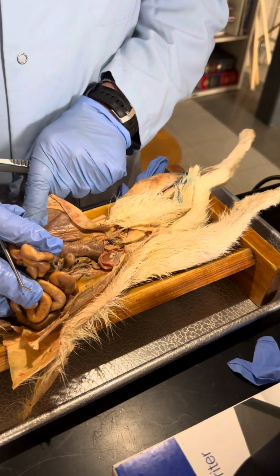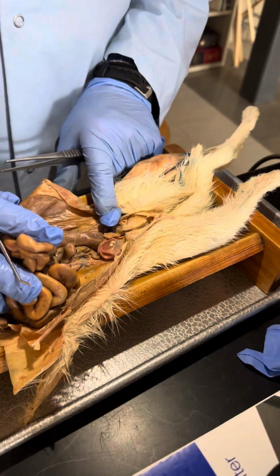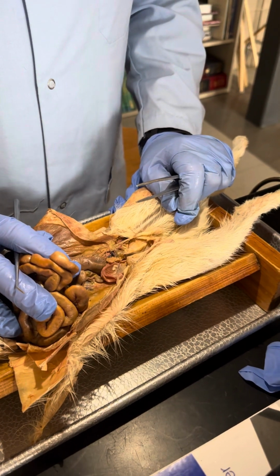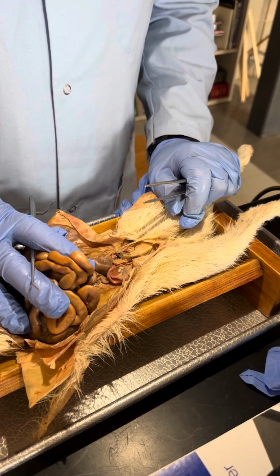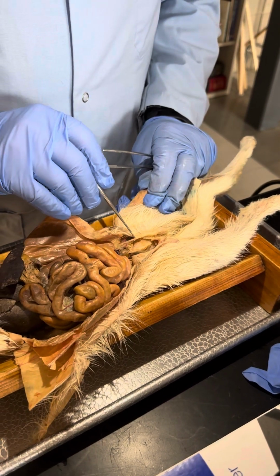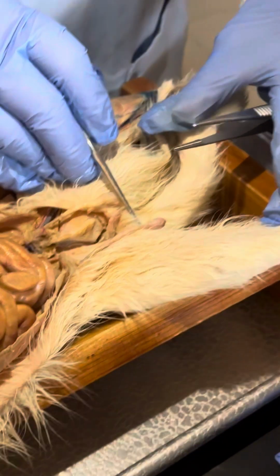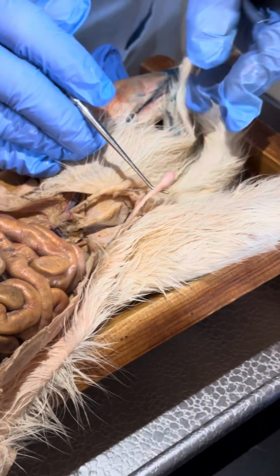The testicles started development up near the ovary, and then they descend. And when they get to the internal inguinal ring, they push through the aponeurosis. I showed you how they kind of take that, like when I put my finger through the glove, and then they end up descending down to the scrotum. So the scrotum is right here. There's like a little pocket where the testicle was. And I've got those out of the scrotum.